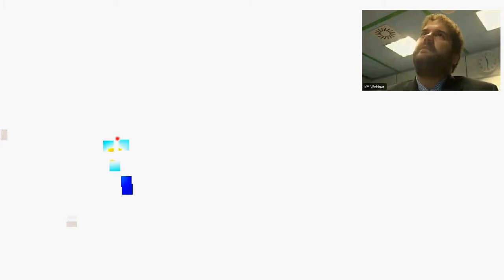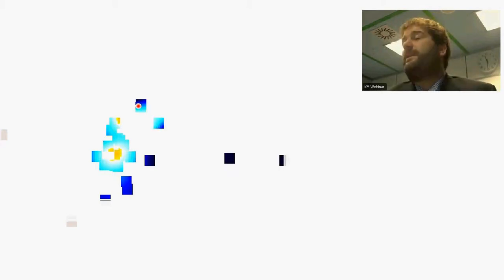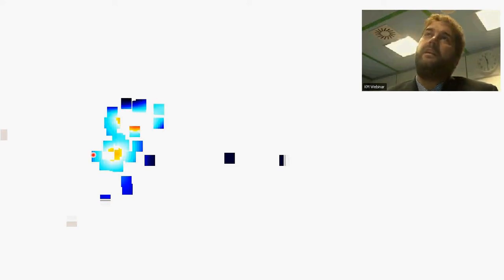This is typically the case. So here, this is actually a fresh state shale sample on which we've done this measurement. What we're looking at here, because this is still very early on, is the water in the sample, because the T1 and T2 are very similar, and nothing else. And of course, this is what's piqued our interest, because this is definitely distinguishable and different than the peak.